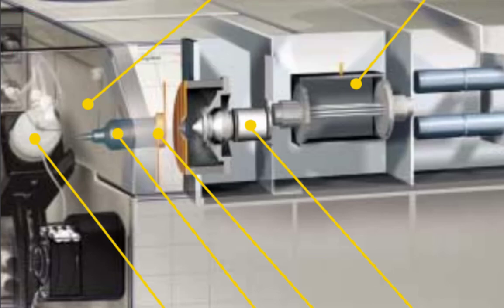So the argon flows in, and the RF frequency causes the argon to collide with itself with such energy that it ionizes and causes a chain reaction of ionization that generates the plasma. And so the torch is made of quartz because it needs to be very temperature resistant. Obviously, this plasma is very hot. The very center of the plasma is somewhere around 7 to 10,000 degrees Kelvin, and the outer parts are definitely cooler, but still quite hot.